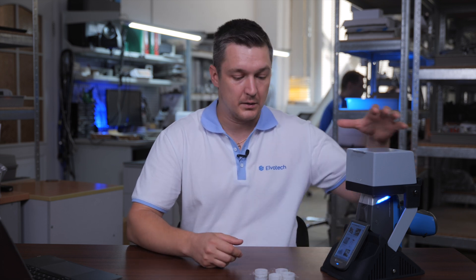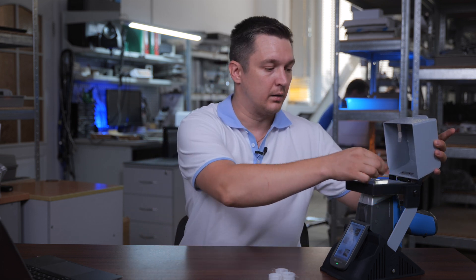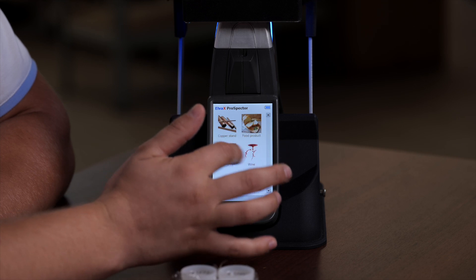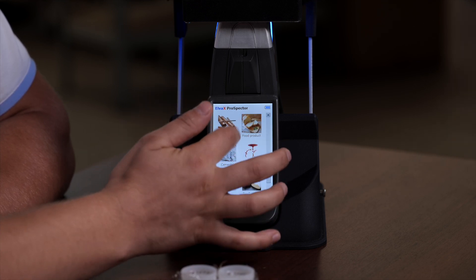As we have already assembled the lab stand, we can start the analysis. We need to place our first sample into the laboratory stand and just close it. After that, we need to choose the right calibration – for this purpose we have a special cement calibration. And now we just need to push the start button and the analysis begins.